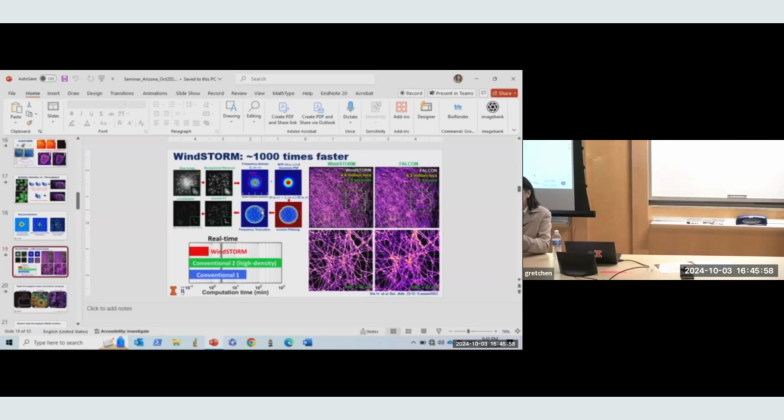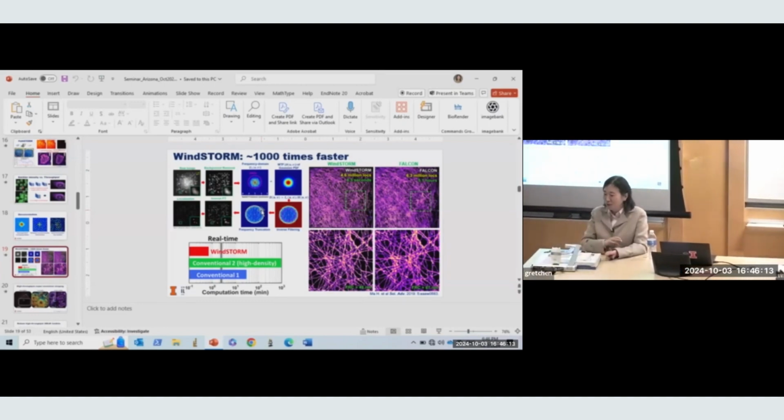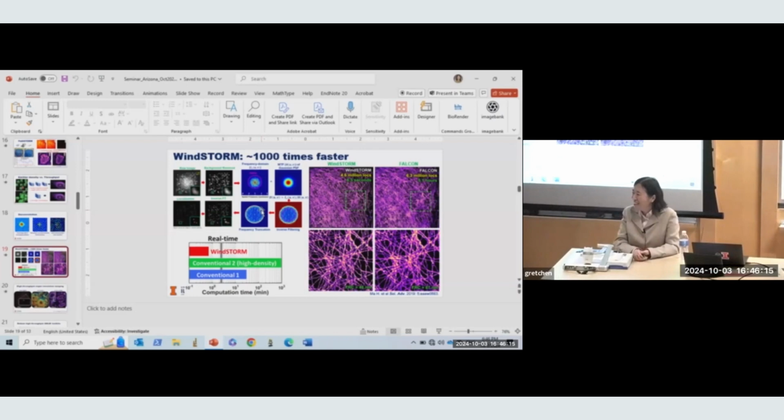Because the NA is low, you're not just losing resolution, you're losing photon counts. That's really the biggest problem. So we were thinking of using some kind of photonic chip to do that, but we haven't figured out how to make those chips yet. Is it 16-bit resolution right now? Yeah. Okay.